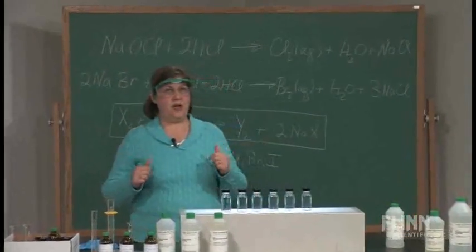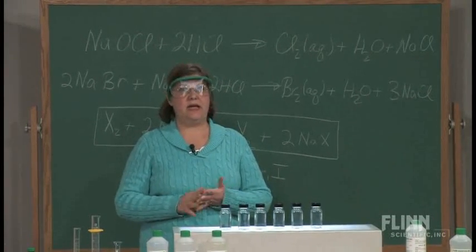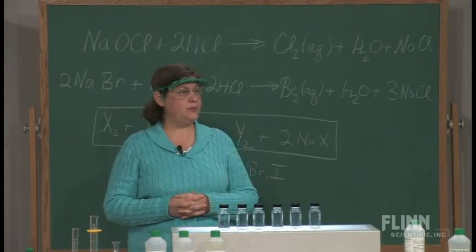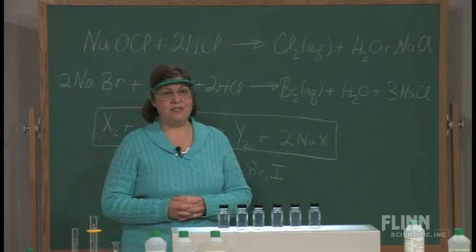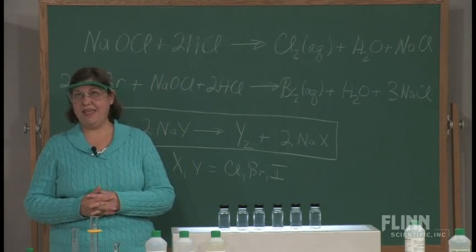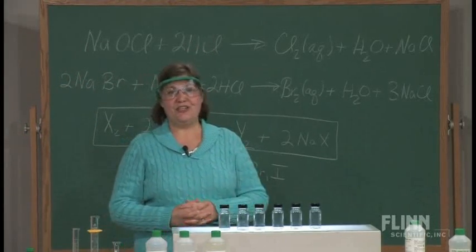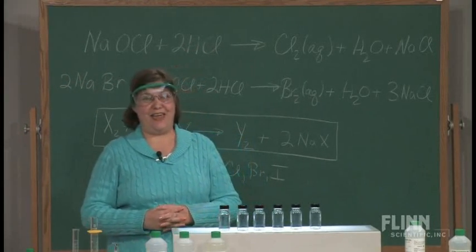Now, your first thought is, wait a minute, I'm going to work with chlorine, bromine, and iodine. Obviously, I need a well-ventilated lab. Do we have the hood on? Let's put the hood on, because we're going to get started here. And I'm working here under a ventilation fan. So can you hear me all right over that fan? Okay, good.